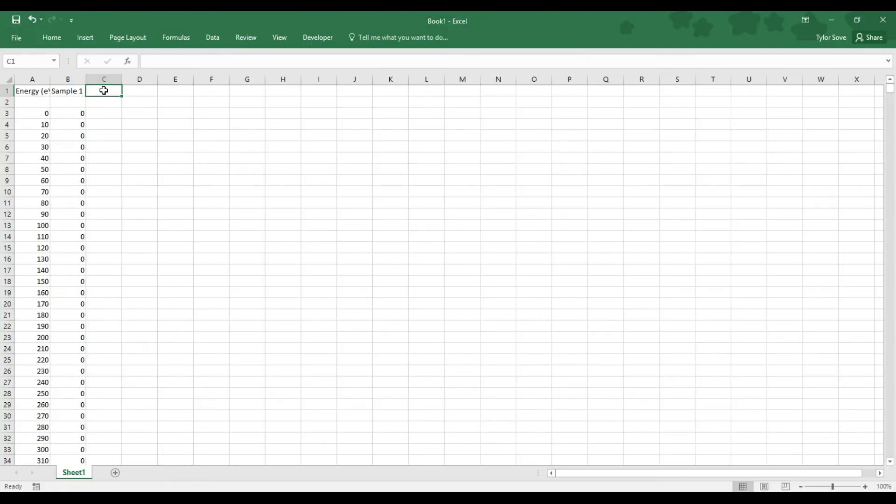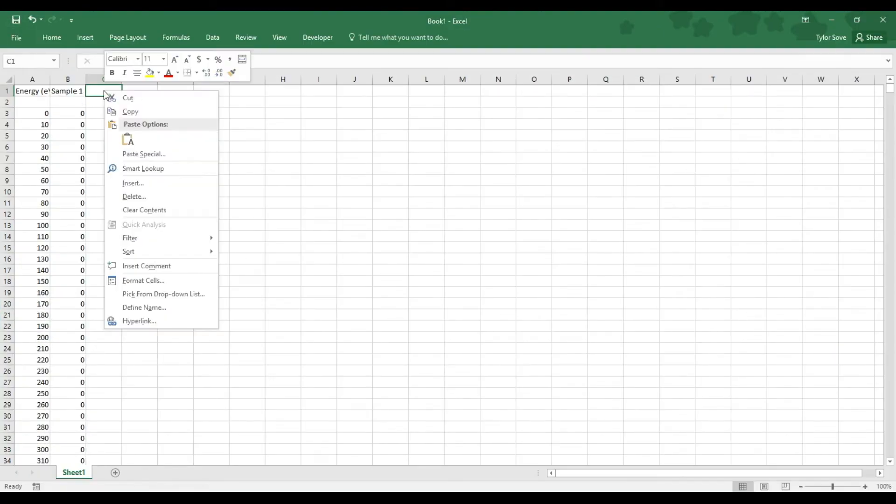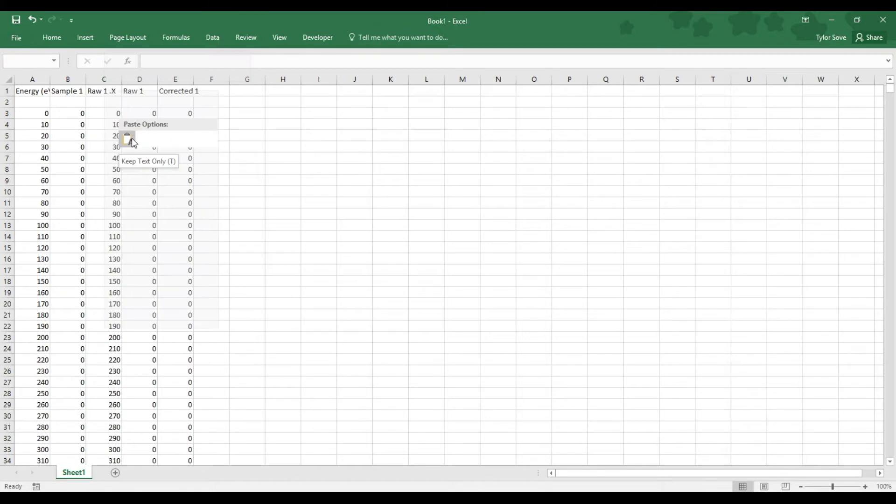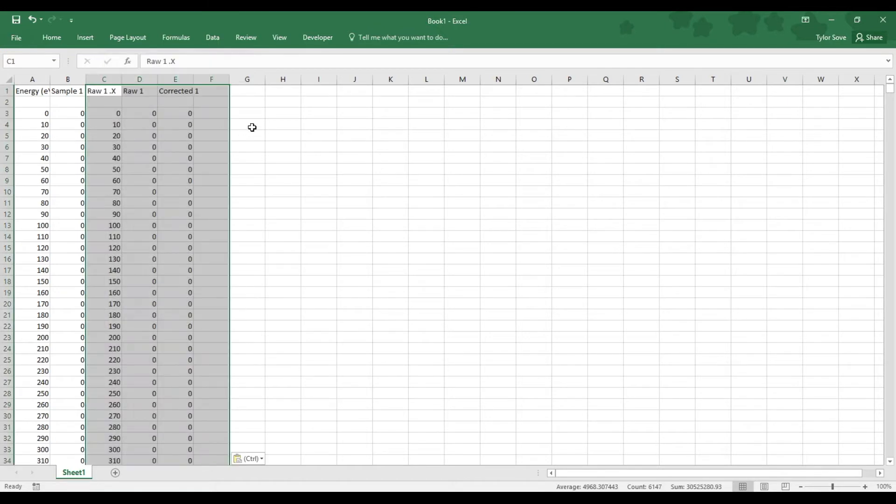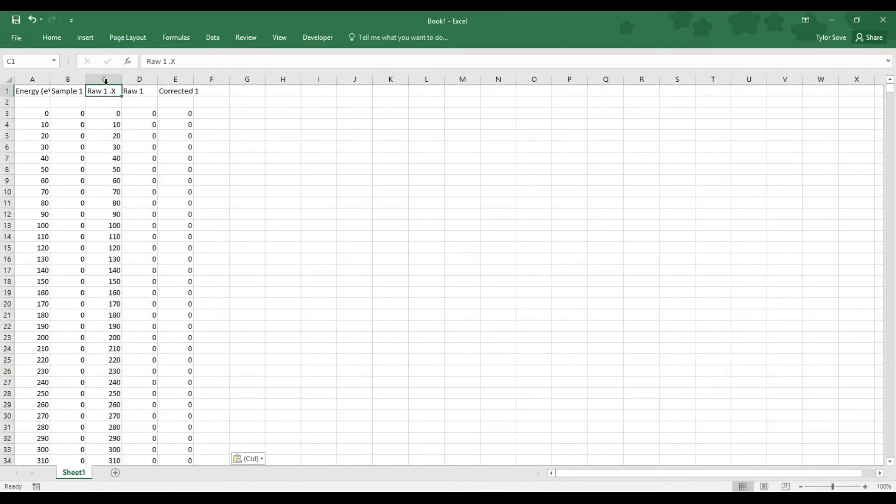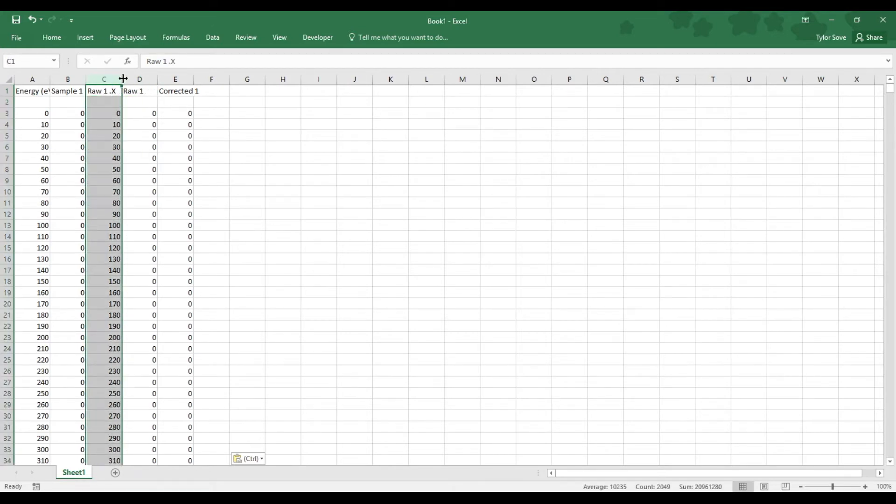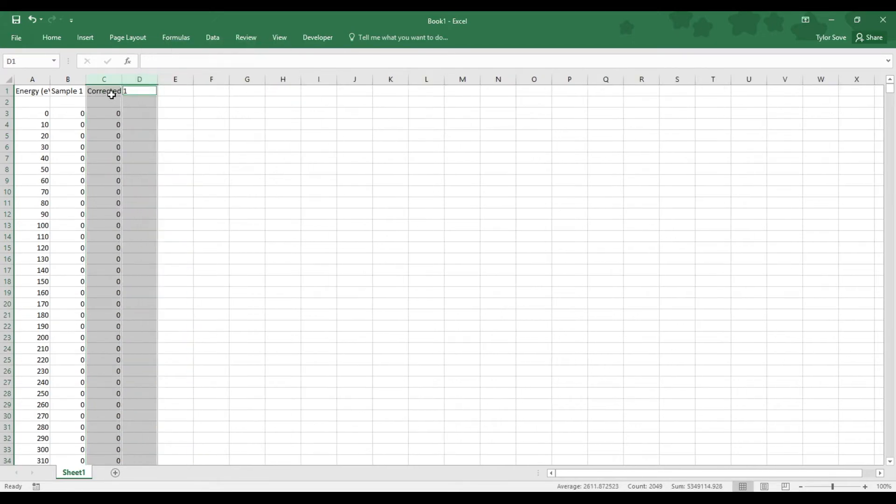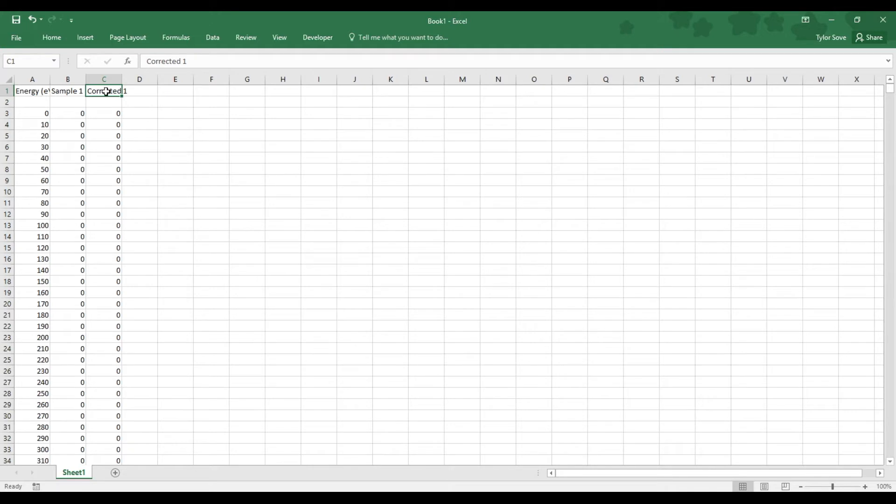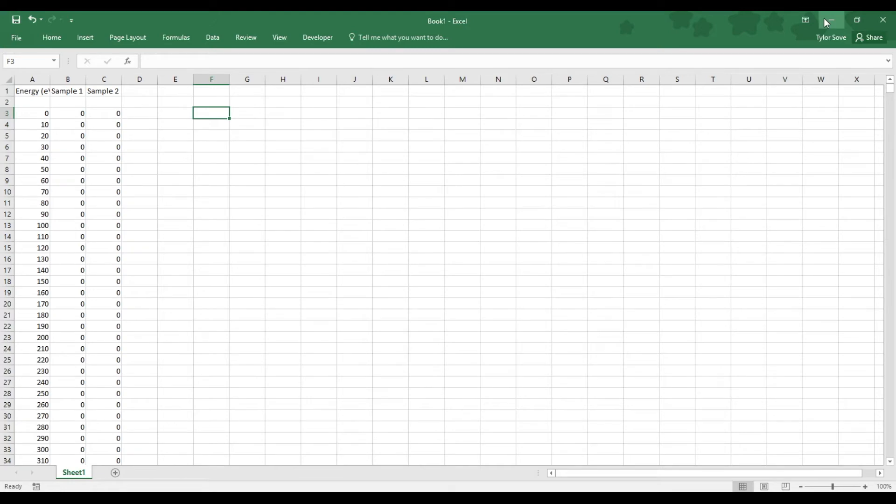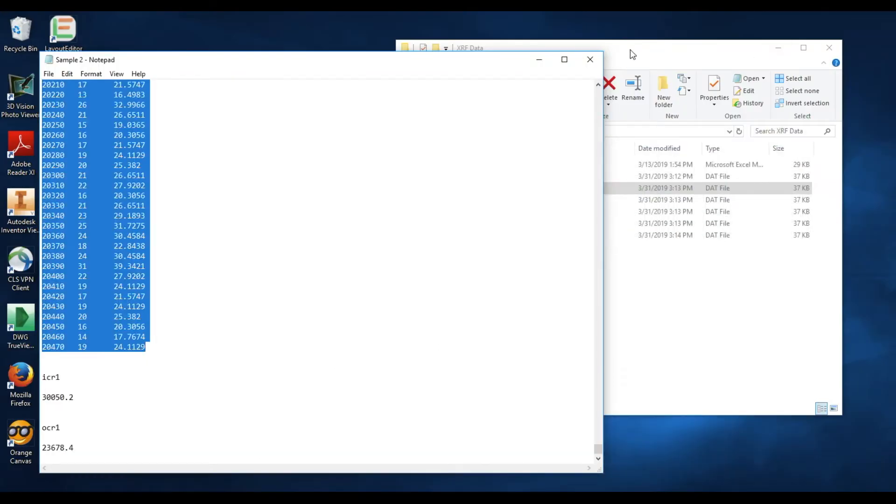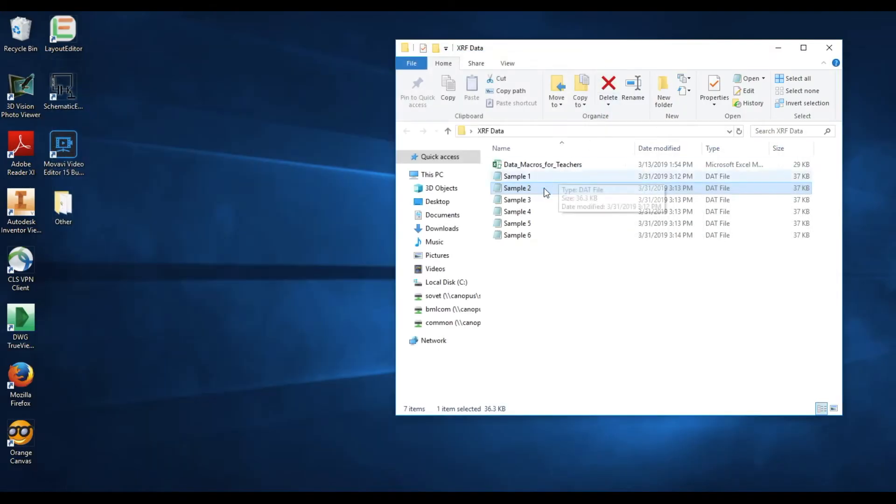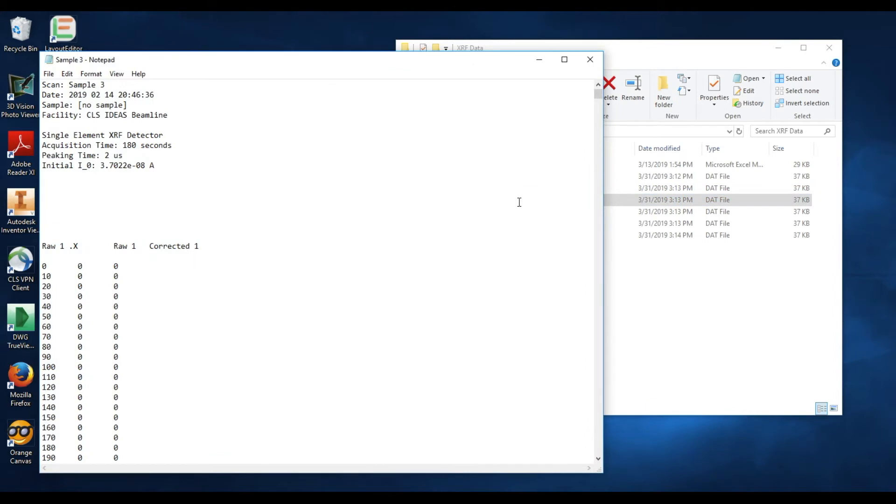Open up the Excel book, now this time in cell C1, right-click and select paste. Now we do not need a second energy column, and again we're going to delete the RAW1. So highlight column header C, hold control as you highlight column header D, right-click and select delete. Now rename this new corrected one as your sample name. We'll repeat the process as many more times as it takes to get all of your sample files in.